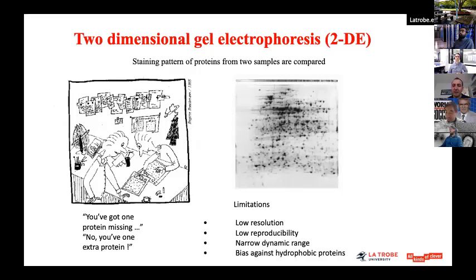So historically, proteomic studies were done by 2D PAGE electrophoresis. We're talking around 20 years ago. And I remember when I was doing my PhD, I did many, if not hundreds of those 2D PAGEs.